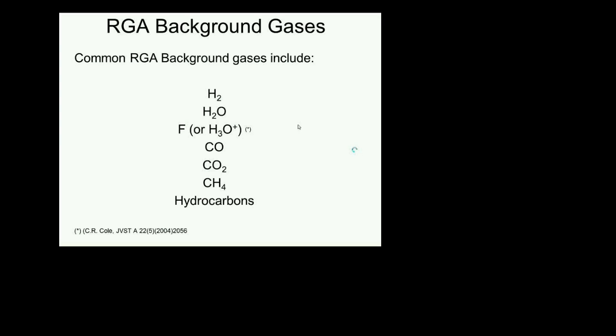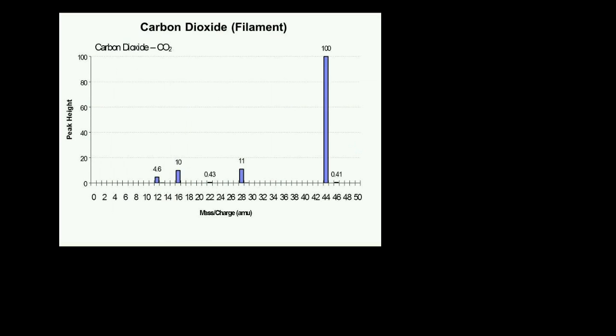You will also get new compounds being formed at the ionizer, like carbon monoxide and carbon dioxide, and you'll be in big trouble. You'll have your pressure go up.